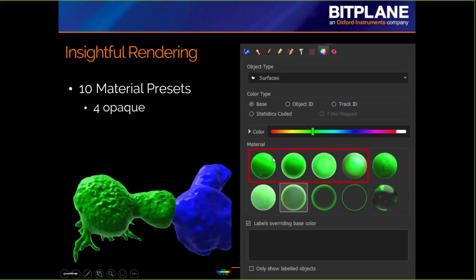And so we see this first one shown here now. And so that has some shininess to it. You do see some shadows. And then this option that I'm showing now is the third one. And so there's more shininess that you see. It gives you a different understanding and then a different aesthetic view of what this surface, what this T cell really looks like.